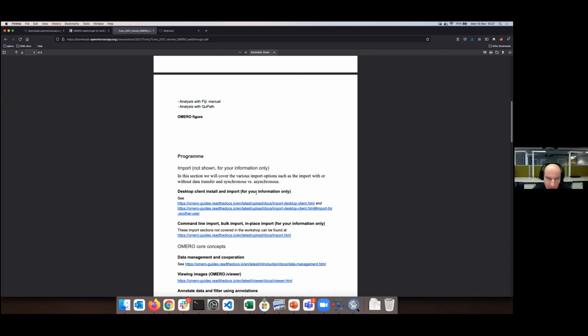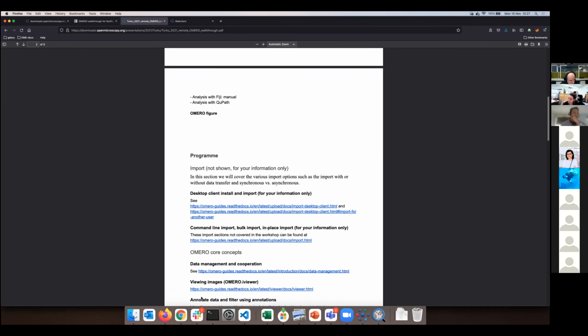Okay. And I think that Joanna distributed to you an email which told you how to install Omero Insight. Now you might have not managed, so try to ask us if you didn't install Omero Insight, if you didn't have time, if you couldn't be bothered, or if it just didn't work. And Jean-Marie can try to chat it out, but this is exactly the hard part on Zoom. The main, I mean, quite important thing is that you simply follow what we are saying here.